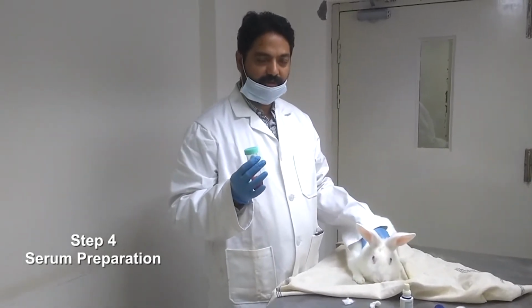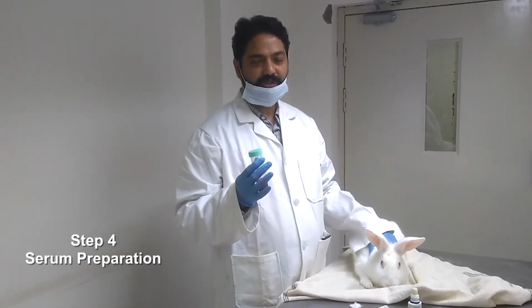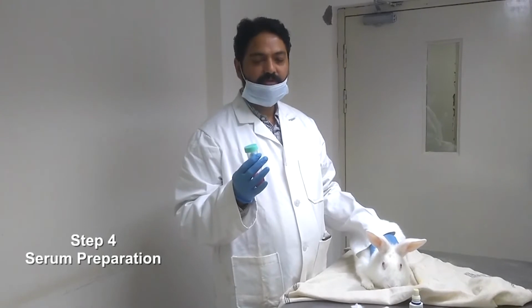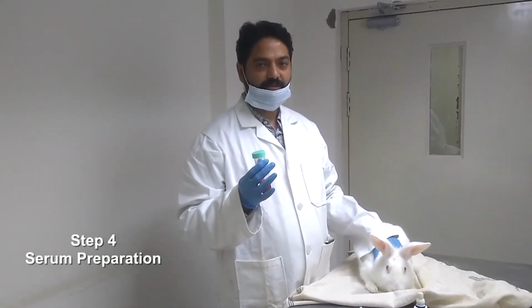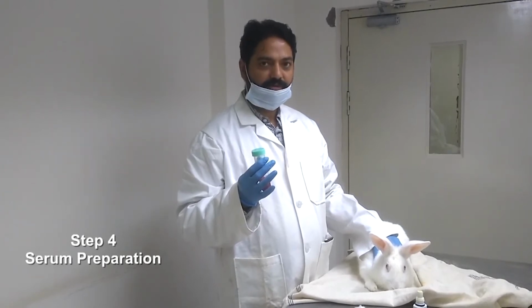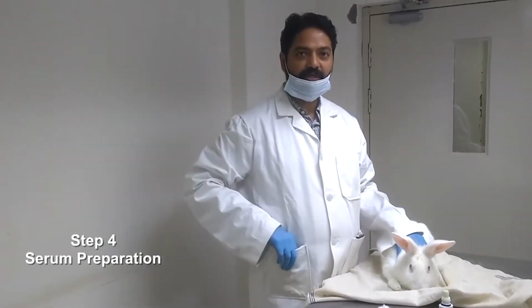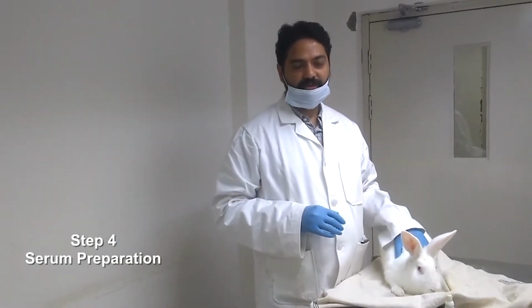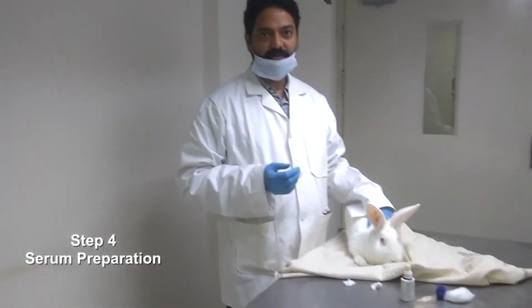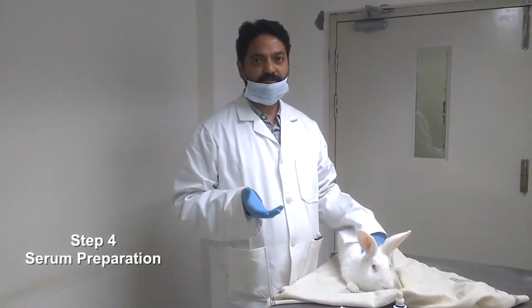The blood will be coagulated at 37 centigrade for 1 hour, and then it will be kept at 4 centigrade overnight, so that the clot is shrunken properly and the serum is maximally taken out. Then isolate the serum, add some preservative like sodium azide, and keep it at -20 or -80 as per the requirement. We also test simultaneously the titer and the specificity of it using the ELISA test and the western blot test respectively.